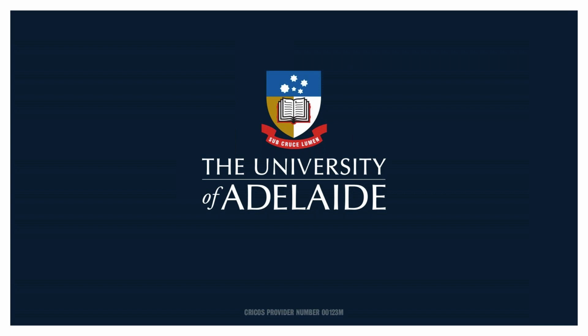Okay, are there any more? Oh, actually, yes, there are. We have a question from Davis McCarthy. How does Conda scale with large numbers of jobs when the dependency graph becomes very large? He's run into issues when running Snakemake on tens of thousands of files in a single cell analysis setting. Any suggestions for handling this sort of situation? Nextflow, I understand, doesn't suffer so much from scalability in that respect.